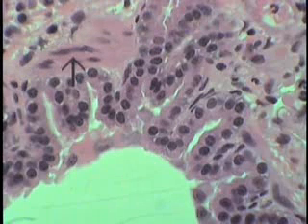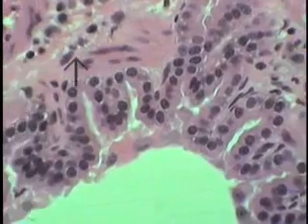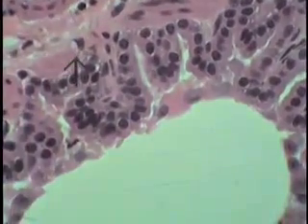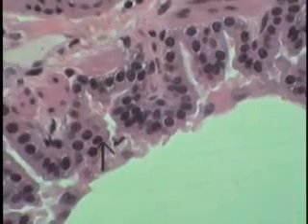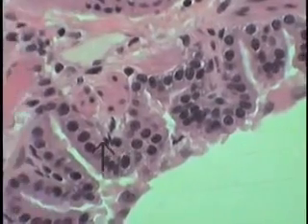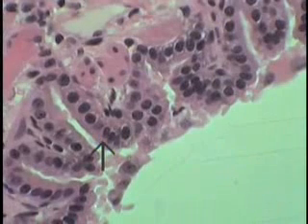There's a clip through the supporting wall of the bronchiole, that is that bronchial smooth muscle. A few of the cells, though it's difficult to demonstrate, do retain their cilia, but no goblet cells are observed at this particular point in this section.